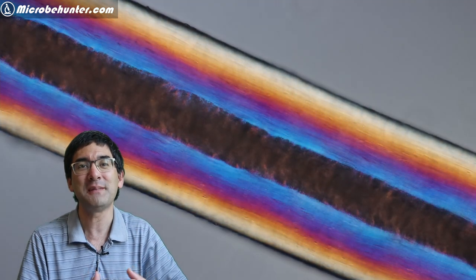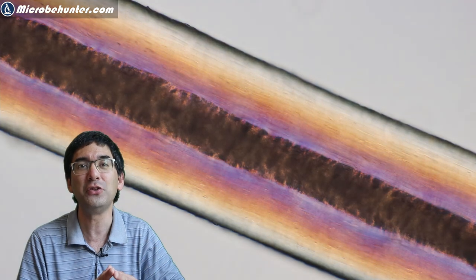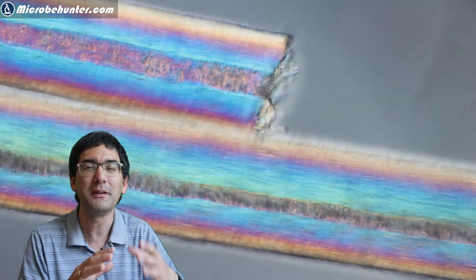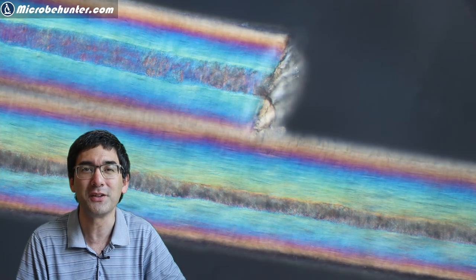...and the changing colors that you see, this is because I'm observing the hair using polarized light. When you change the polarization, you get all of those color changes as well.